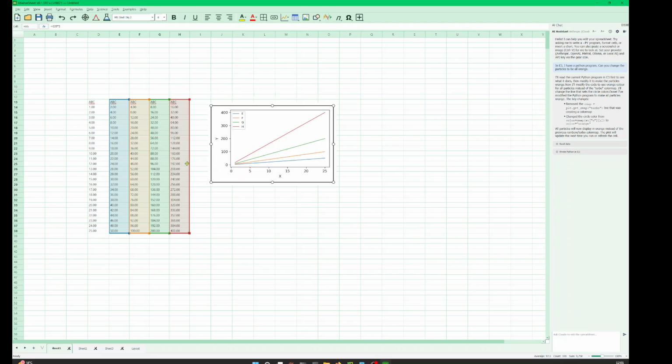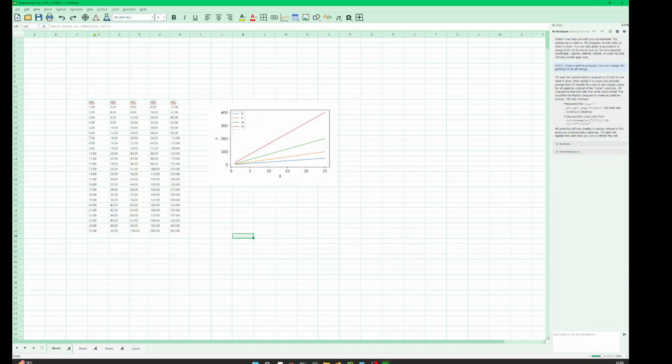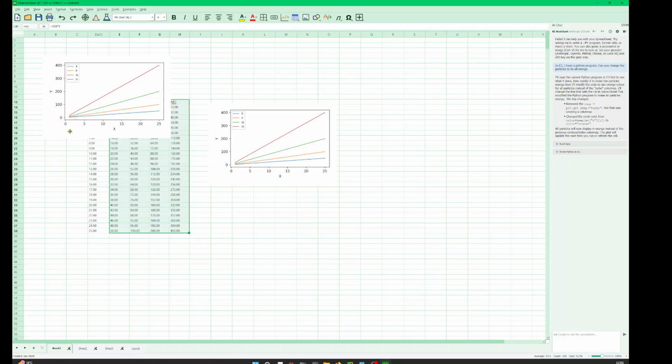So this is kind of what you would see. So for example, this one here, I can move it and you can see it disappearing. Okay, it's not easy to see when it's selected as well. So it's easily showing you 0, and I go on there and it's there. I can move up and you can see it changing, and so on. But if I want to make it in function of X, on origin, we would do something like set as X. And now if I just plot those ones, it will then know that those are X values.